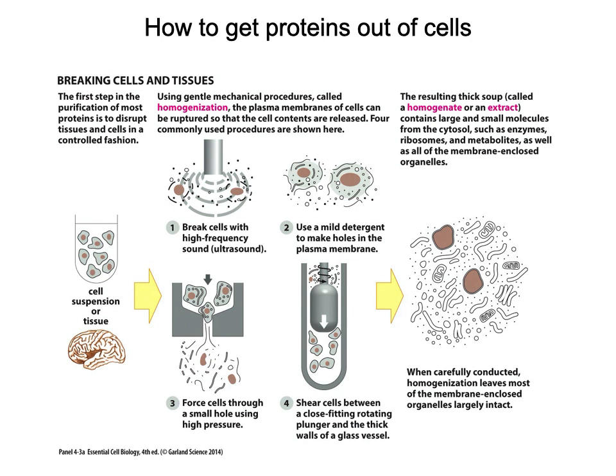But in the lab, when you want to create these homogenates, you add the detergent, and it's going to break those cells that you're studying apart, and the material inside is going to be released.